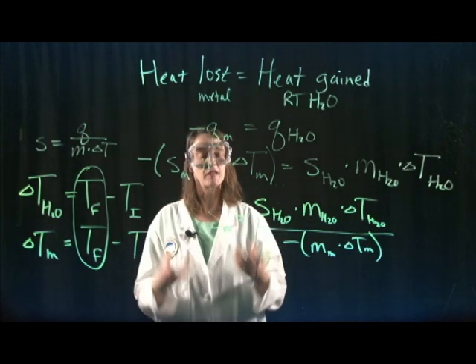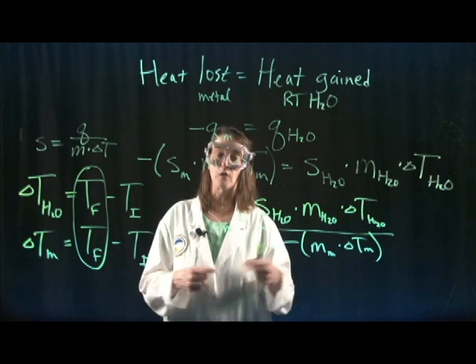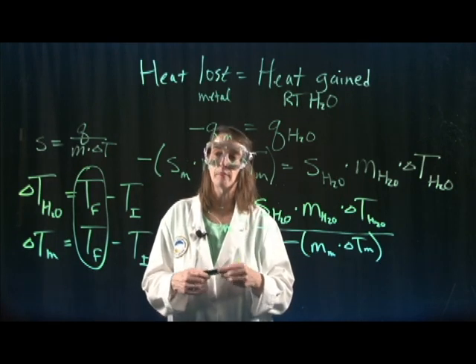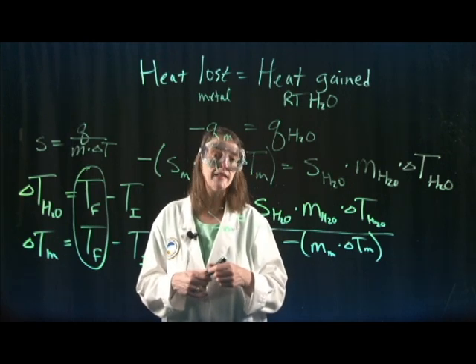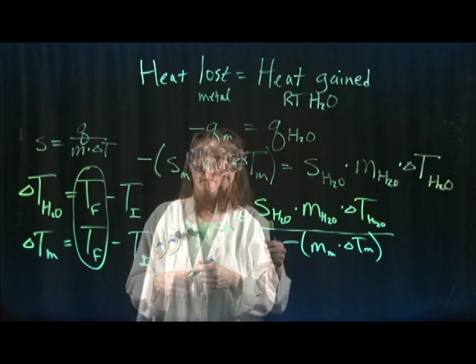The process of dissolving a solid may be exothermic or endothermic. You'll measure the temperature either going up or down when that happens, and you should be able to measure what we call a heat of solution, which would be in joules per gram.